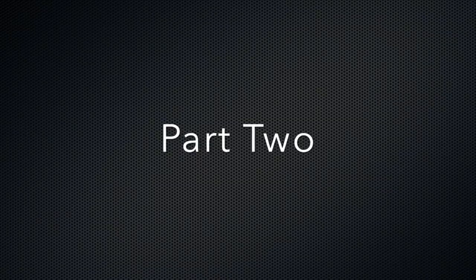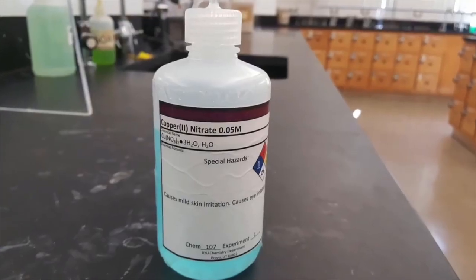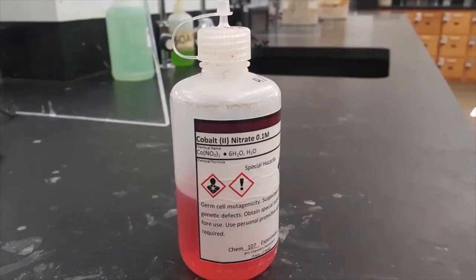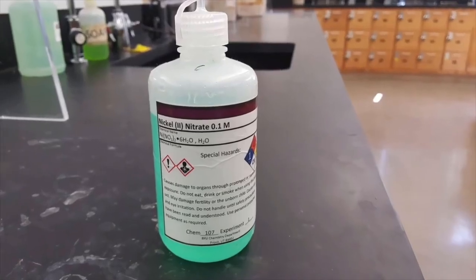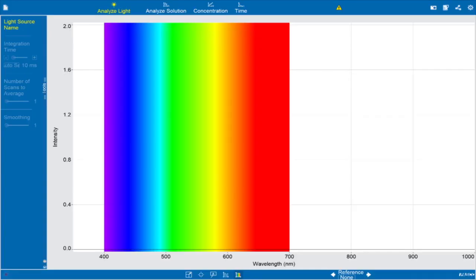We'll now begin Part 2 of the experiment. Like in Part 1, you'll be investigating Beer's Law. In Part 2a, you'll be varying substances — we have three substances: copper 2 nitrate, which is blue; cobalt 2 nitrate, which is pink; and nickel 2 nitrate, which is green. Before you begin, make sure you've downloaded the PASCO Spectrometry software onto the device that you're using.